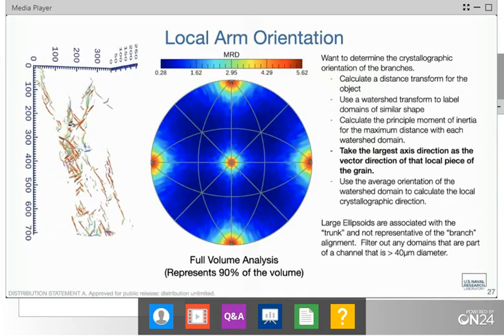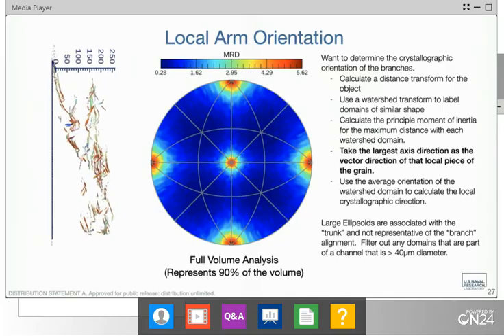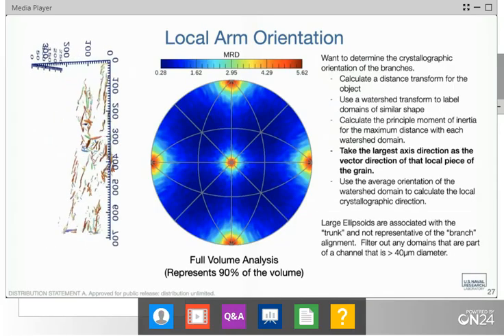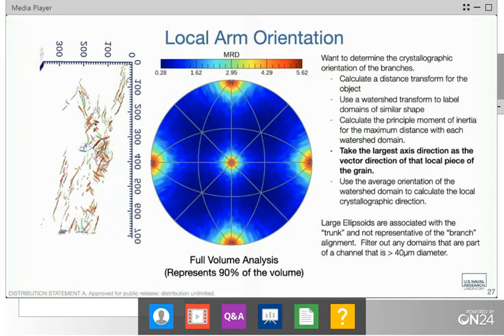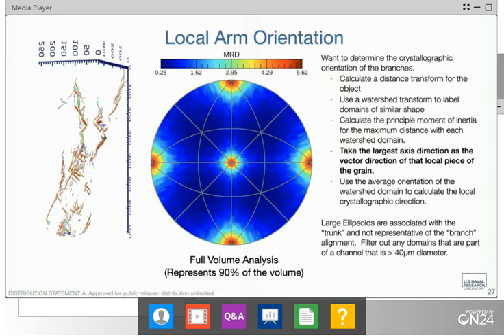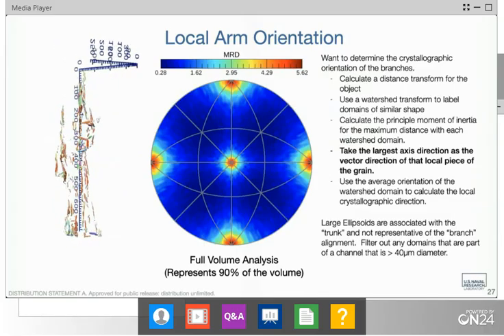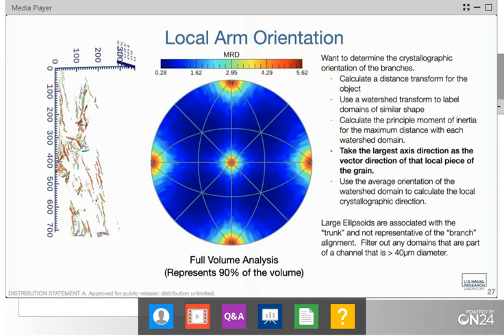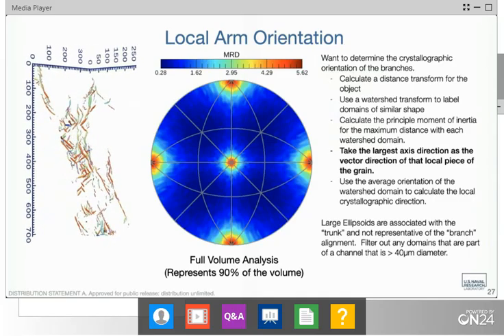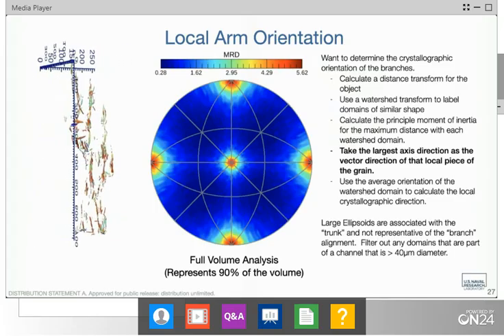But I will admit it's still a very heuristic decision, and it's not really a quantitative thing. I think there are maybe some other techniques we need to look at. The world of bainites and martensites is extremely complicated, and it's one of the great challenges of how we as metallurgists clearly identify between those phases in terms of a definitive processing route for their formation.